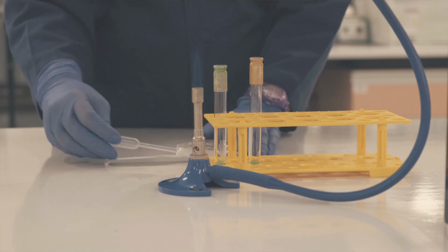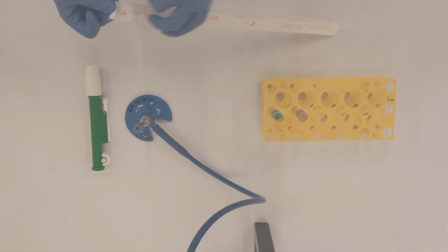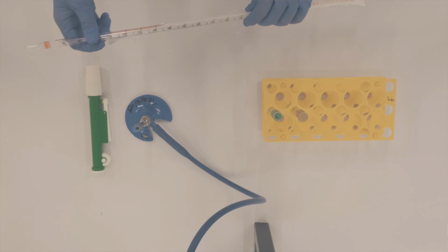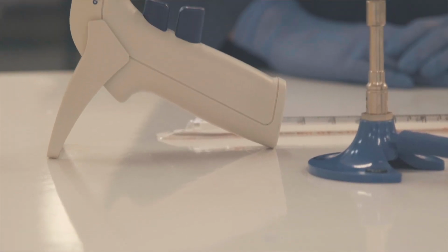Avoid contact between the end of the pipette that will touch the liquid and any other surfaces. Graduated pipettes are used for larger volumes of liquid, anything over 1 milliliter, and its volume measurements are labeled on the side of the pipette. Both manual and electronic pipettes can be used.